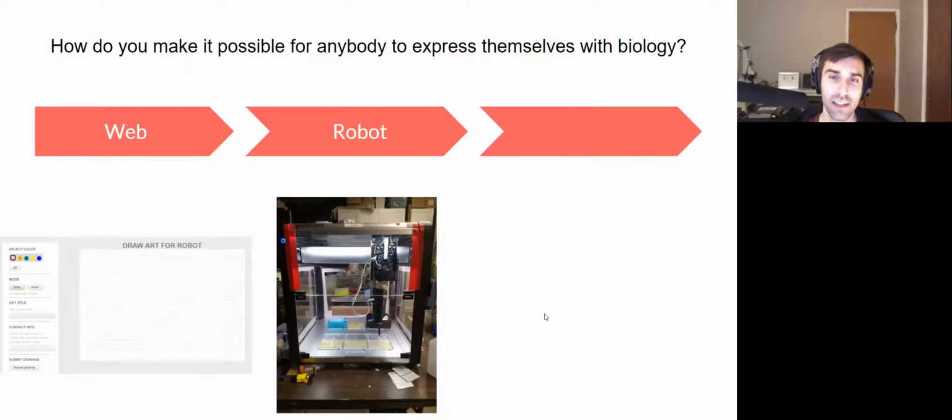coli, and they have plasmids in them that you might call reporter plasmids, to say, yes, I'm expressing the right gene. In our case, we really only care about the color that comes out. Often in microbiology, you would say, I see that it's glowing green, which means that my insulin gene has turned on. In this case, we're really only interested in the colors. So we have 5 of them, and I've put there 1 bad one because my nemesis teal is still in our set until we can figure out a better one.